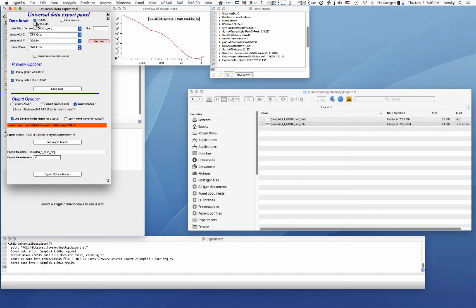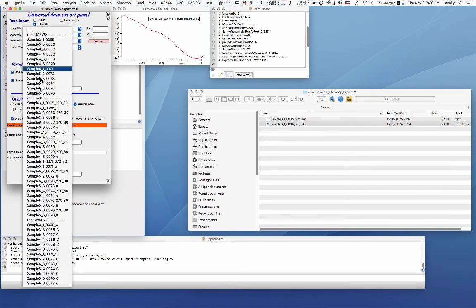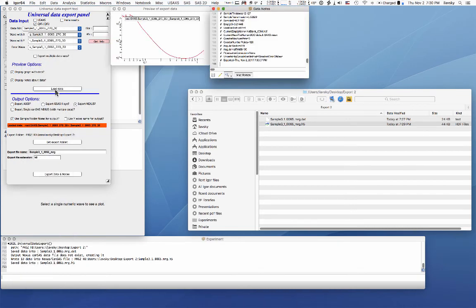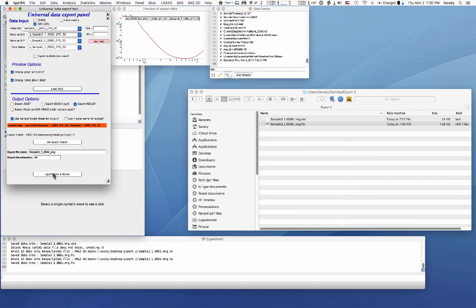If you have powder diffraction data and you can use USAXS data or QRS data, it doesn't matter. You can go here and you can load these data. And then you can export these data.